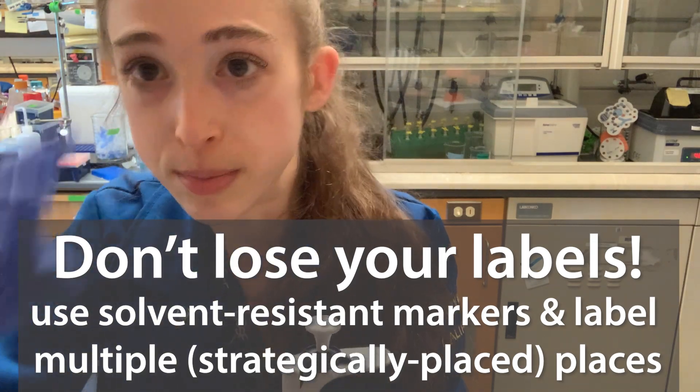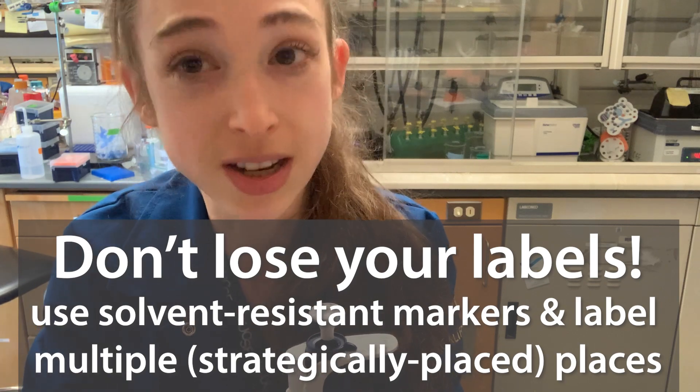Then you end up with your DNA — why is it black? Maybe you've got some Sharpie in there.